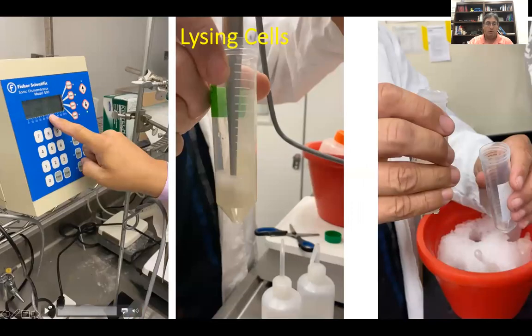Let's walk through how to use a sonicator, and this is very specific for this kind of sonicator. Basically, we want to turn this on, and be very careful with the probe. Never turn the probe on, as we'll see in the video here, until the probe is in the sample. Start low and turn this up high enough so you get good sonication, but not so much that it gets foaming, or what's called cavitation. So let's watch.